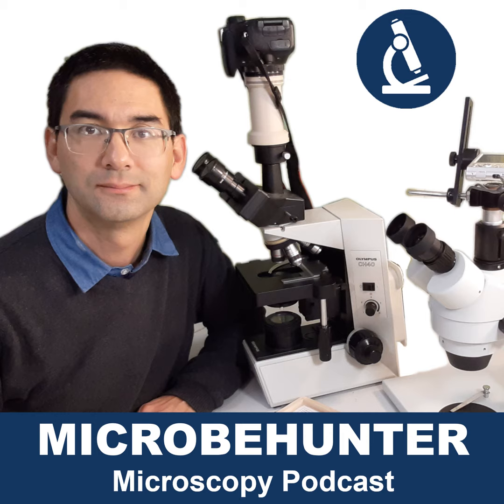So hello and welcome, Microbehunter here again, and in this episode I want to talk about 10 common beginners microscopy mistakes.